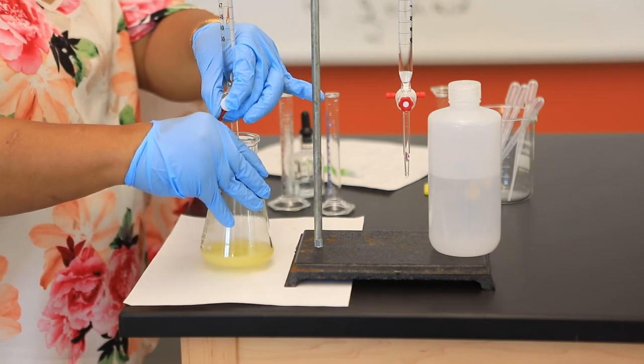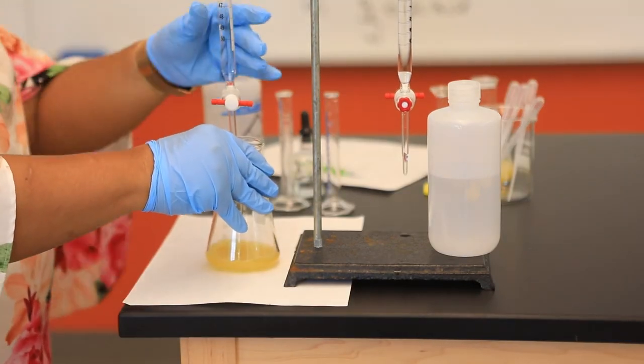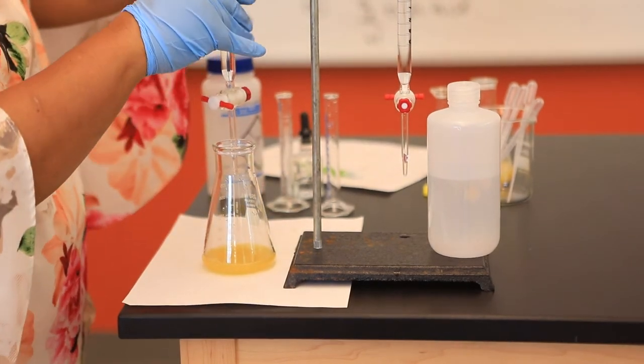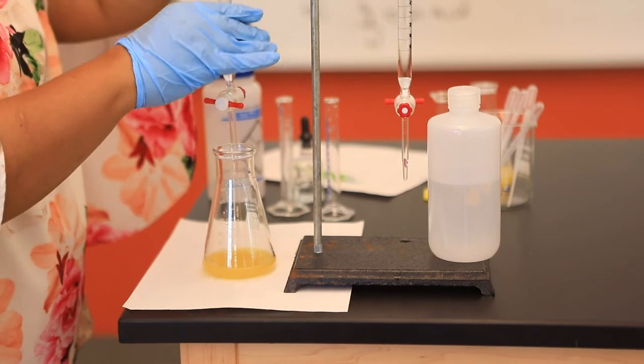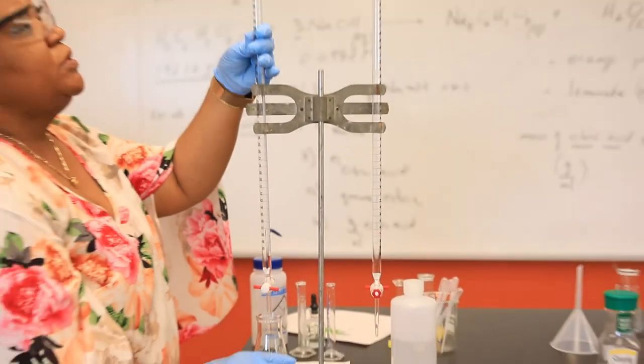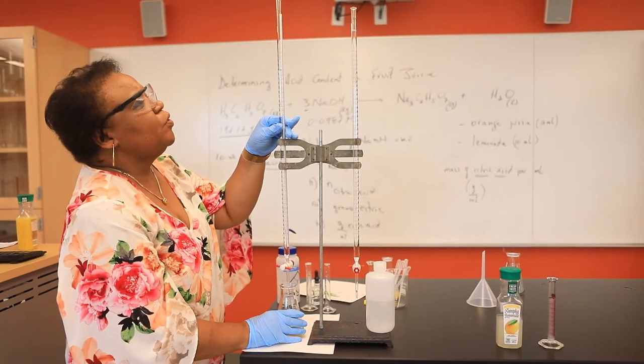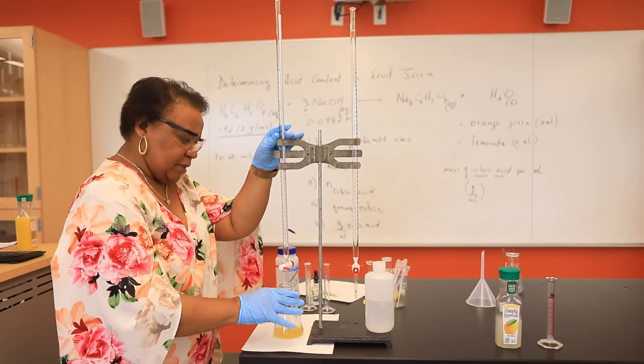Might just be a bit soon. Now you'll notice that there is a color change after we've added our sodium hydroxide solution. Please make a note that the volume, the final volume, is actually 11.10 milliliters.